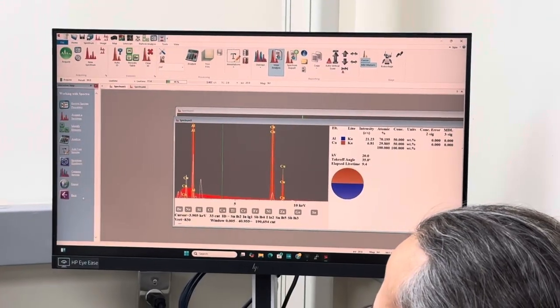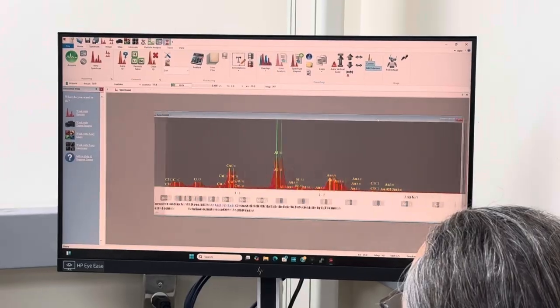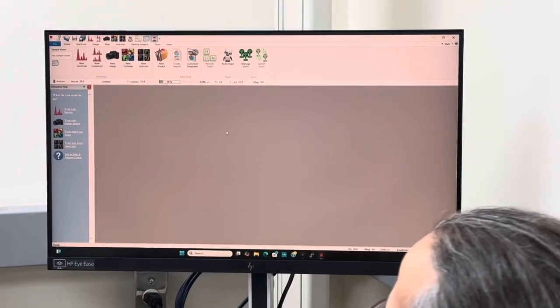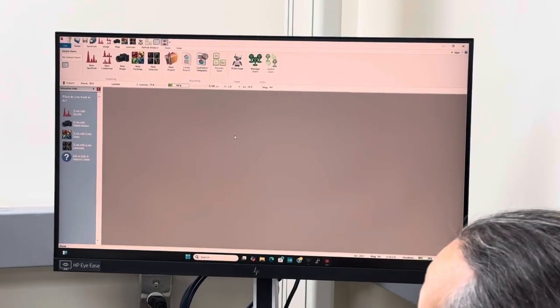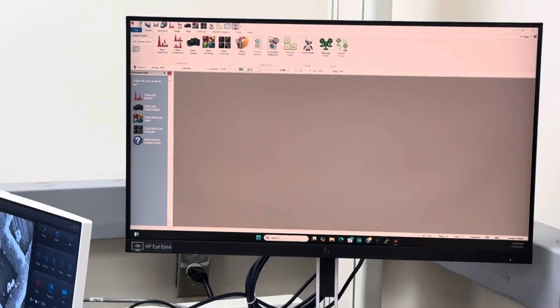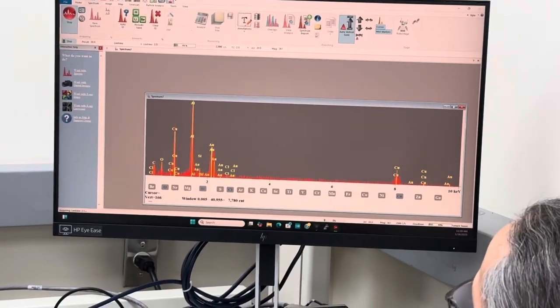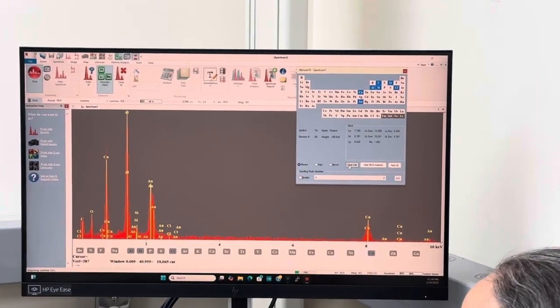And then back, and then back, and then get out of here. And this is exactly how the software window opens. And we just decided to tell it to play with Spectra, right? I could have come here and just hit new Spectra, and it'll acquire Spectra. It remembers the labels from before, so I could just call it the periodic chart, and then I could clear the list if I want to.